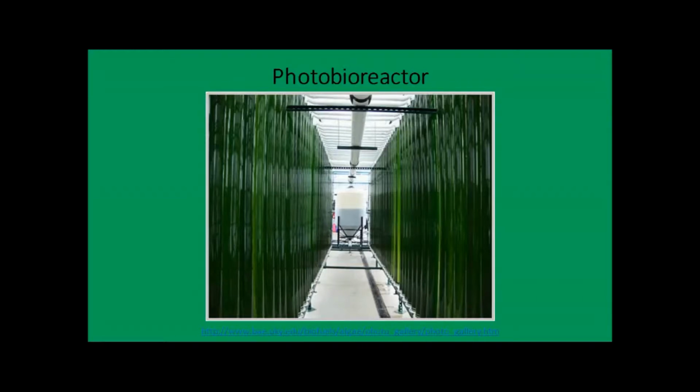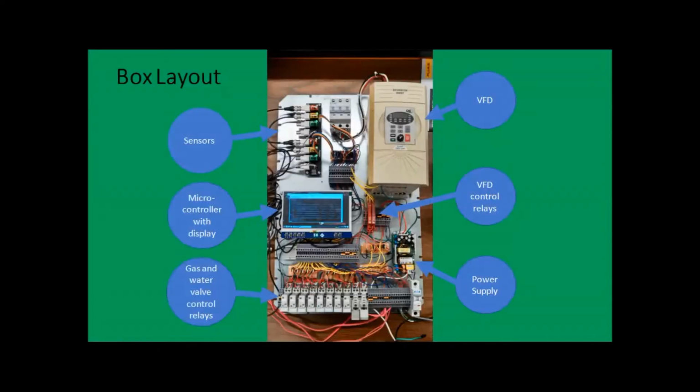Team 2 was tasked to build and program a control system for the photobioreactor with the intent of keeping the total costs low for increased marketability. The control box, shown here out of its case, will be used to measure pH, conductivity, dissolved oxygen, and water temperature for two different algae banks.